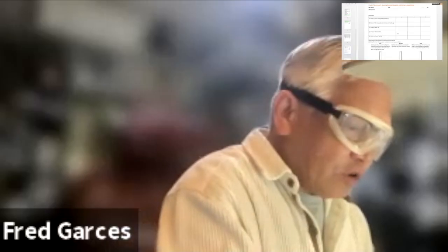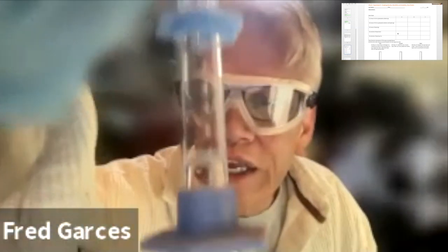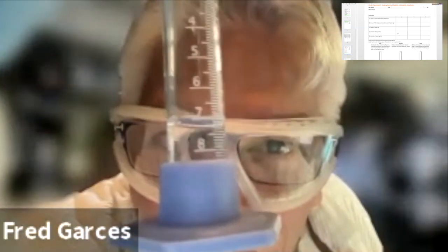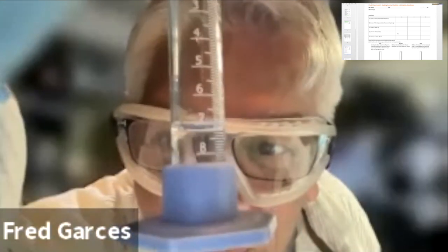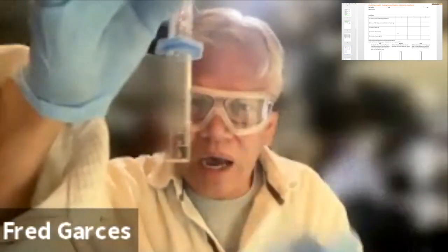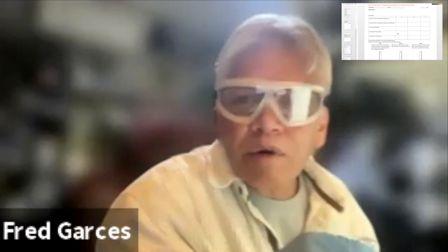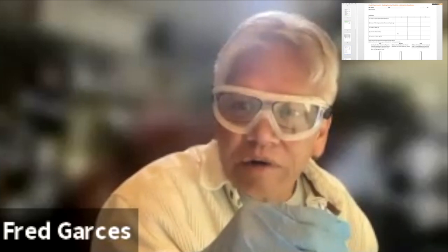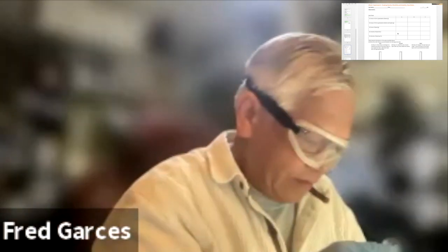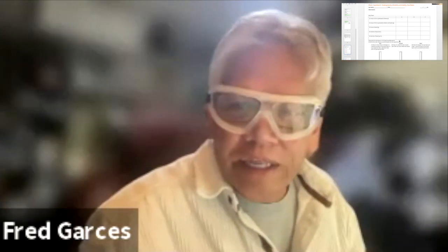Then the volume is based on me actually reading this, and I've got to get at eye level and read the volume at the bottom of the meniscus. If you can't see it, remove the bottom and then read the volume. So this particular volume for me is about 2.85. Remember, I'm reading it to the hundredth of a milliliter. 2.85, that's what I would record right here. Don't worry about calculating the density.